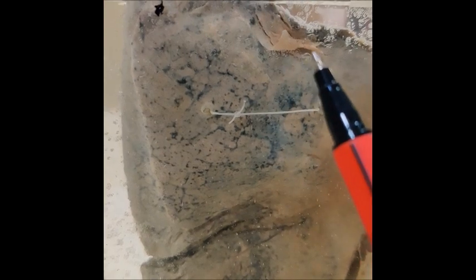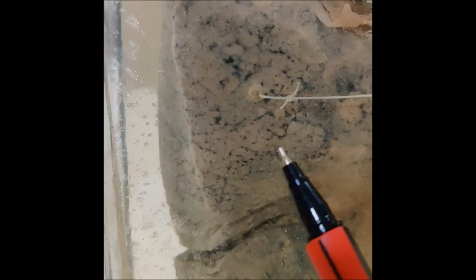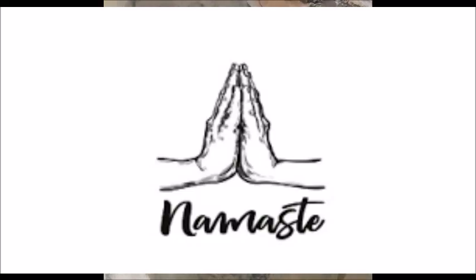So the pleura is also grey white. Here you can appreciate the thickened pleura. The parietal, this is the visceral one. Okay. So this specimen is lobar pneumonia in Grey Hepatization.